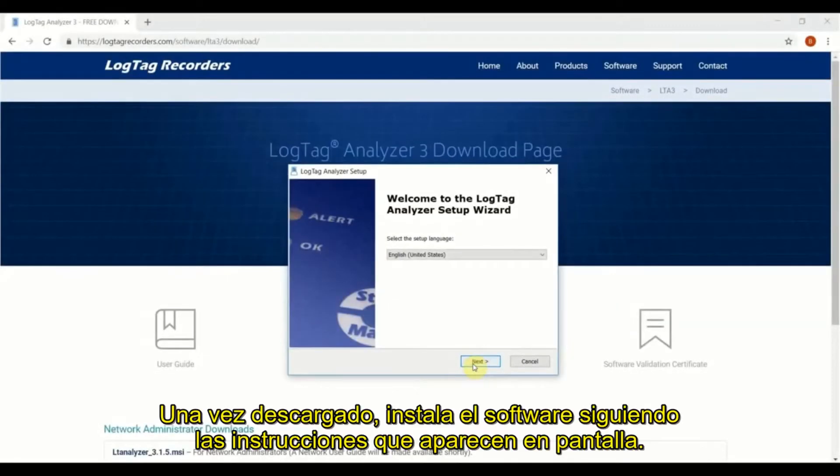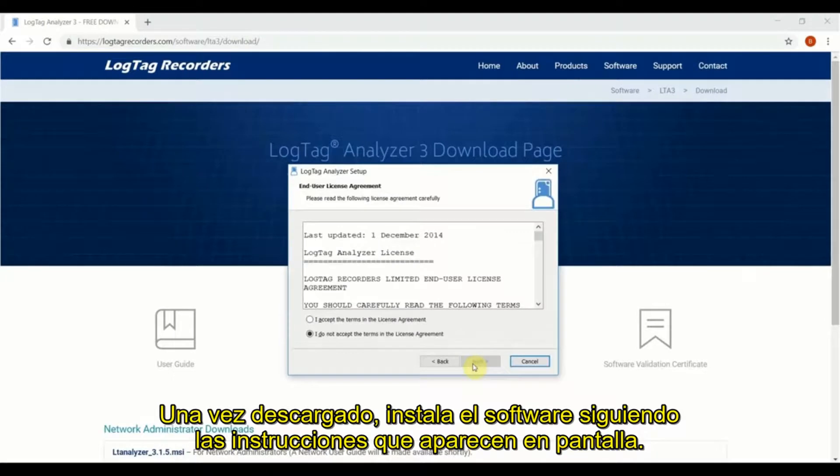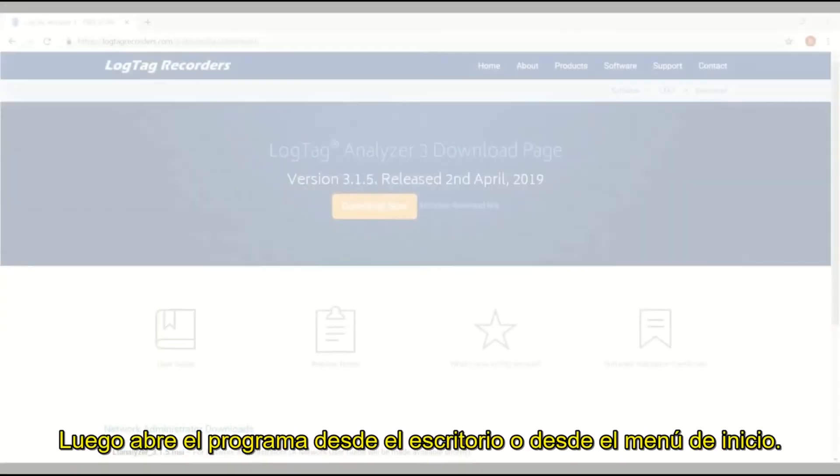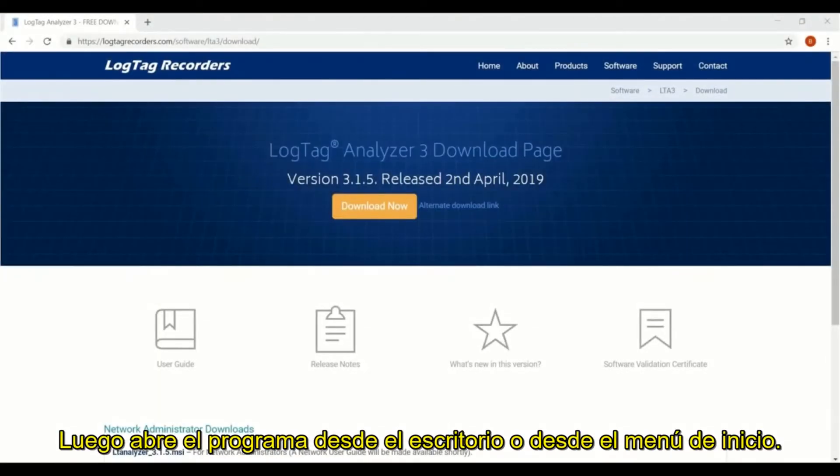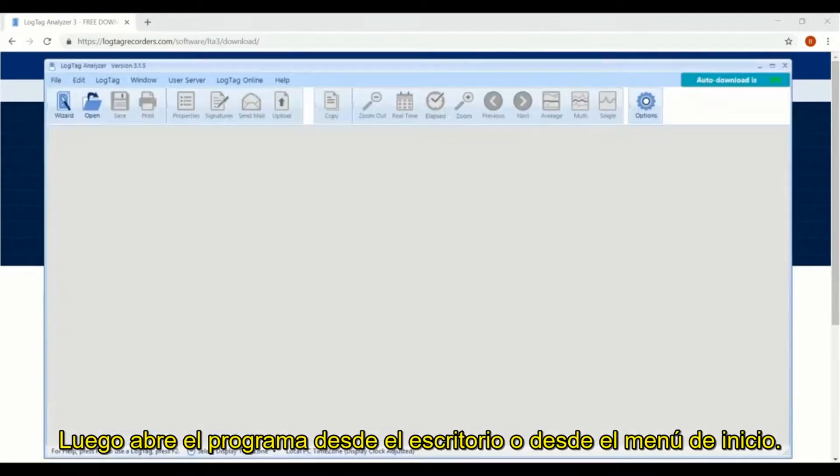Once downloaded, install the software by following the on-screen instructions. Then open the software by clicking on the shortcut on your desktop or from the start menu.